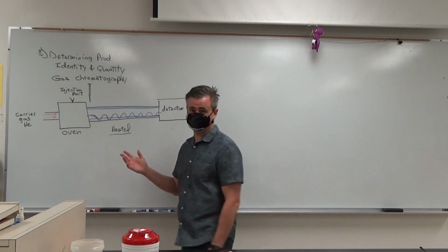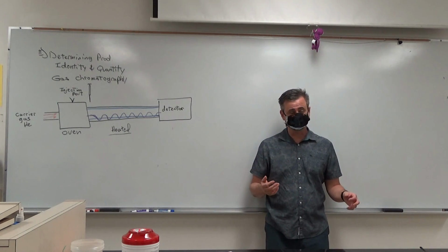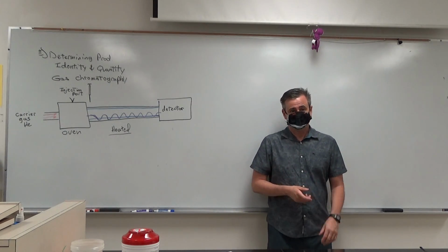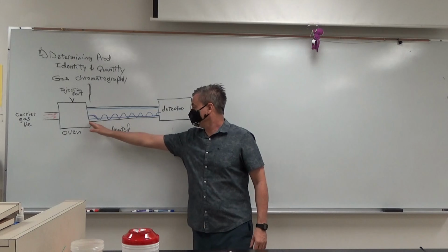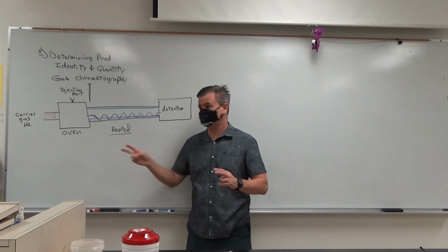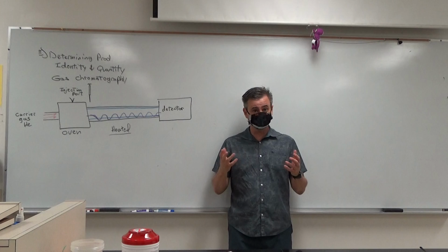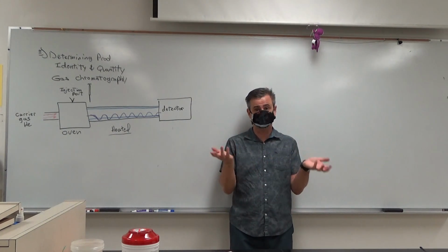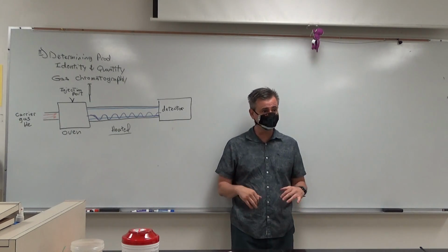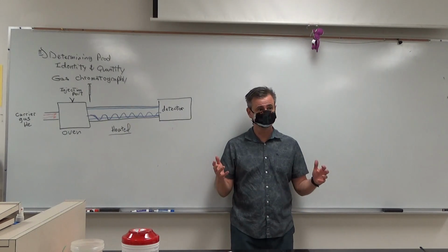Okay, so boiling point. Yeah. So the things that have a higher boiling point, is that going to take longer or shorter? Longer. Yeah. The time that it takes to go from here to here is called the retention time. It makes sense actually. How long it's retained on the column. So those things with a higher boiling point are going to have a higher retention time. They're stuck in the column longer. Those things with a lower boiling point, shorter retention time. Make sense? Beautiful.